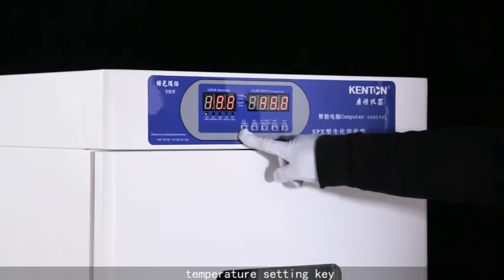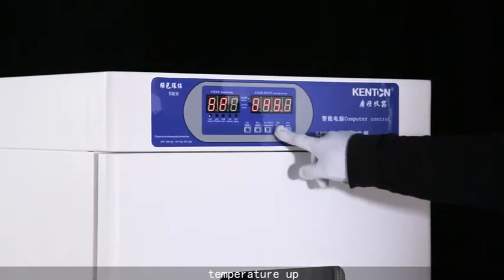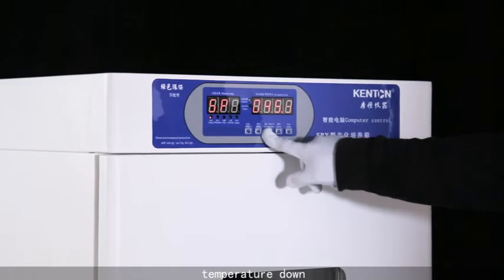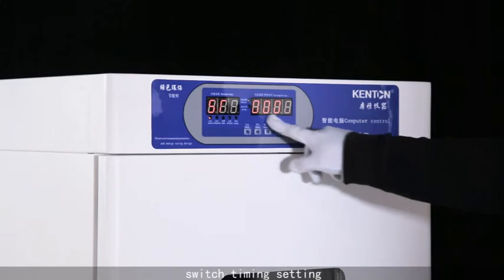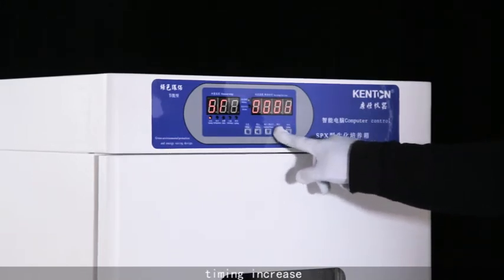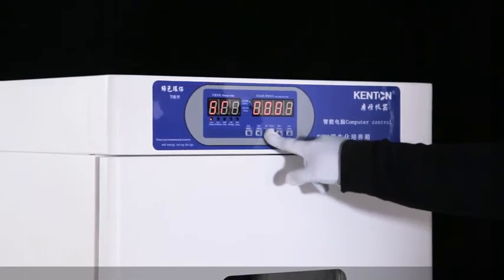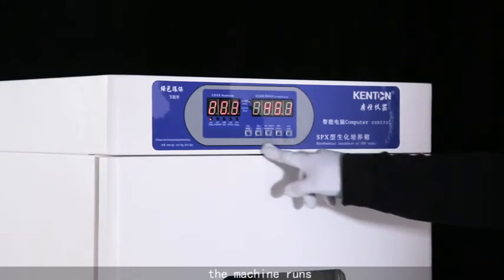Temperature setting key, temperature up, temperature down, and then press set key. Switch time setting, timing increase, timing decrease, then press set key to confirm. The machine runs.